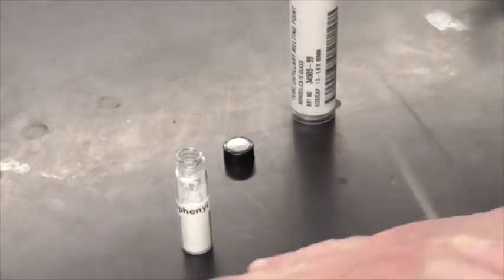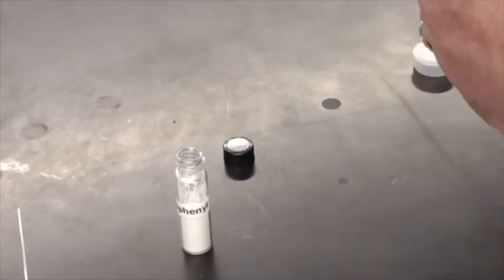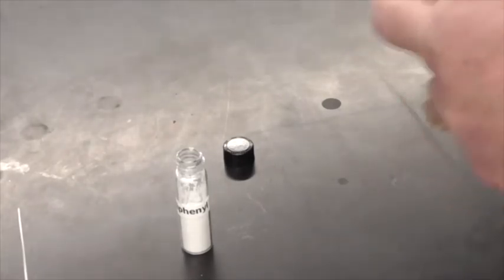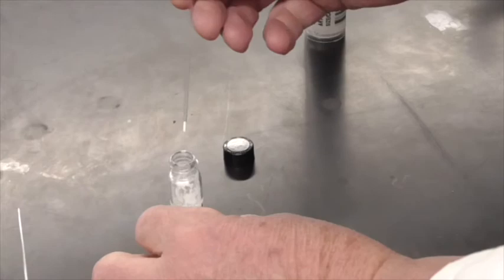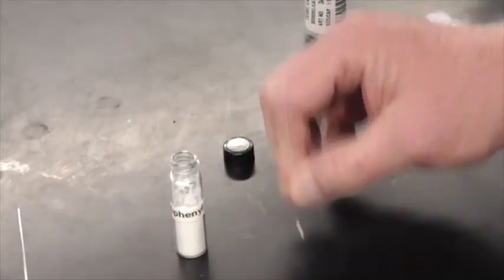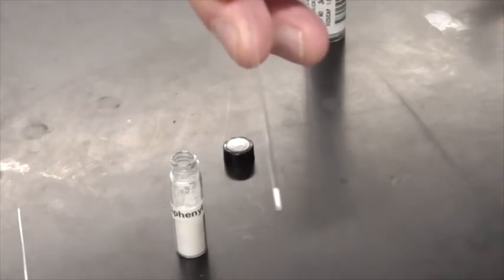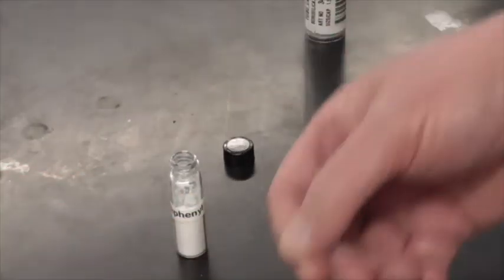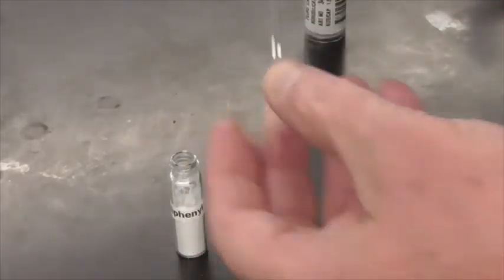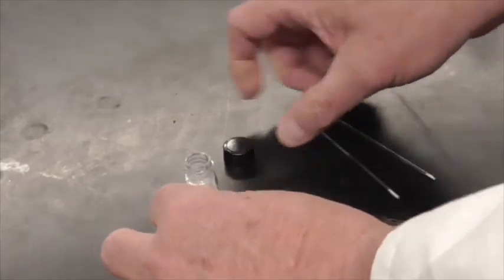Okay, and I have to do this twice because I need 2 samples of biphenyl because we're going to be measuring 2 trials. So I'm just going to do this again. And tap it down. And you don't need very much, just a little bit, just so we can see it when we're watching it melt. Right? So our 2 samples, I got a little bit more than one of them. Our 2 samples are ready to go. And now what I'm going to do is attach them to a thermometer.